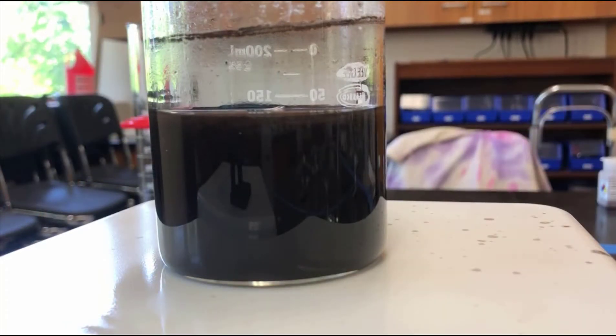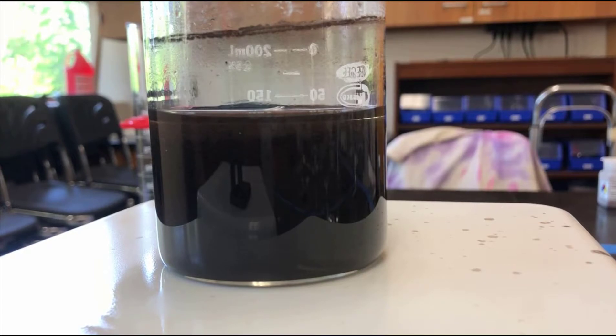I finished heating it and I think it's completely black now. What we need to do is give it a little time and see how it settles. I'll have to stir it occasionally because it is boiling.